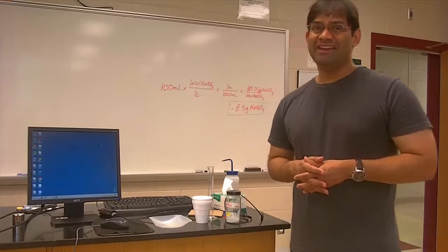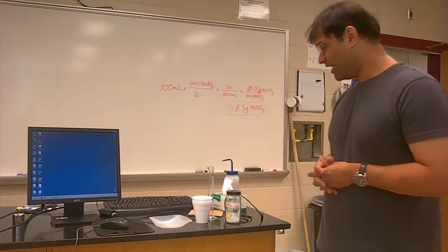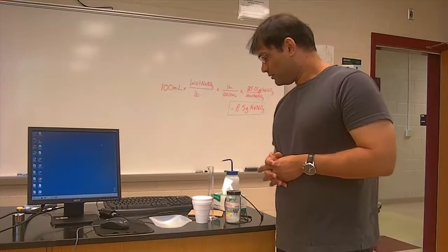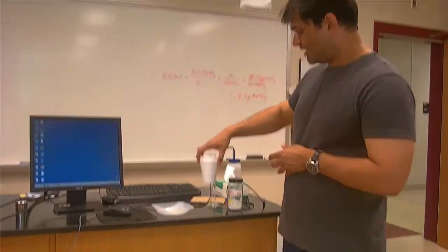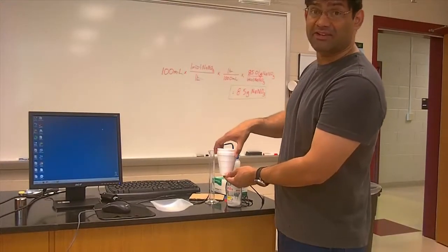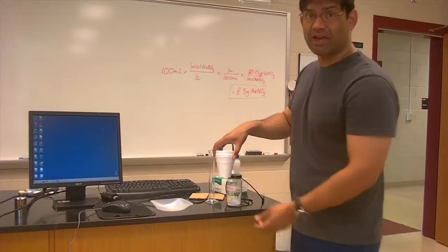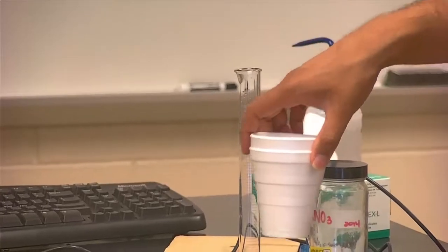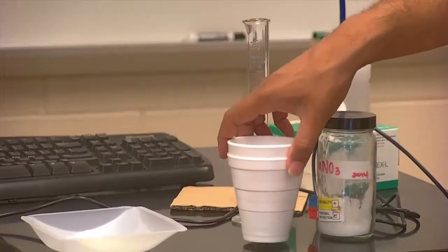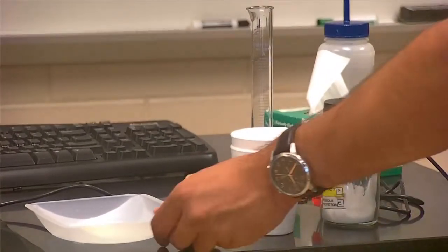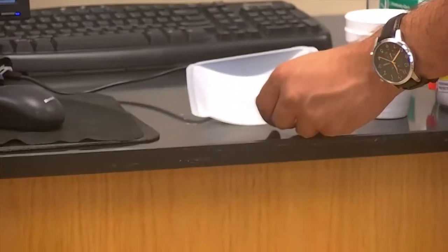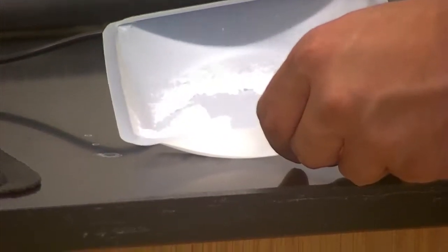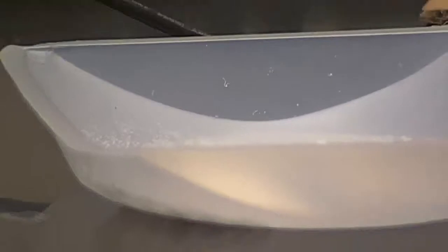You're measuring delta H. Our calorimeter is basically two styrofoam cups. I've already weighed out the appropriate amount of sodium nitrate, NaNO3.